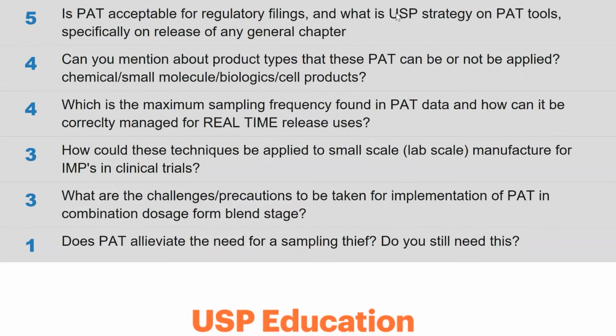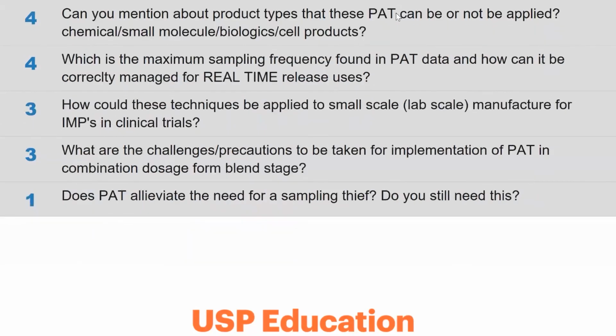In fact, near IR spectroscopy, which is really a workhorse, has its own guideline on submitting near IR data for process analytical technology. It goes through exactly what you need to submit and how to submit it. It's a great guideline.